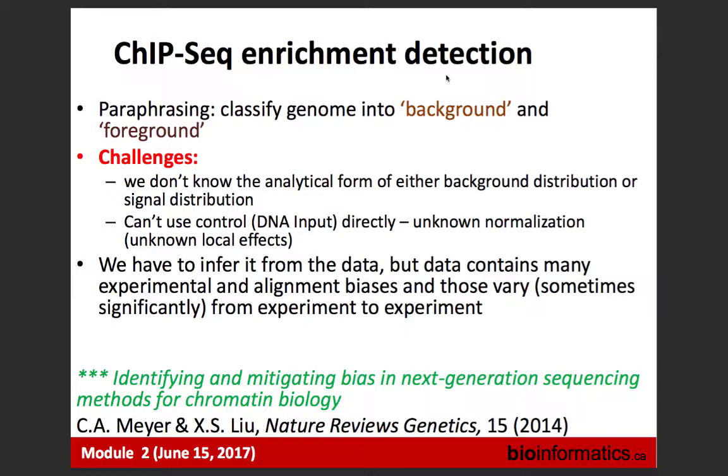Yes. For your negative control, like you're talking about infection, could it be, let's say somebody is looking at skin cancer, could normal skin be your negative control, and you compare it with your melanoma biopsy? Right, yeah, I mean, yes. Well, but in this case, if you would say, I'm not interested in those locations which are enriched in both, then it will include those artifactual locations as well. So you would expect those artifactual locations to be the same, and therefore, if you are looking at the difference, yes, it will cancel out. However, not recommended.